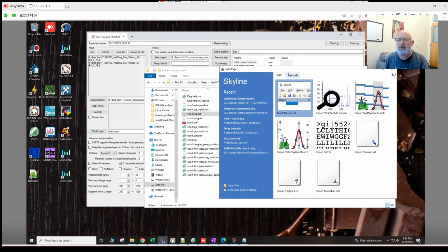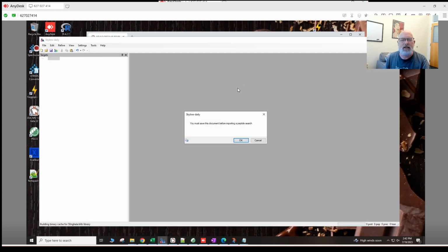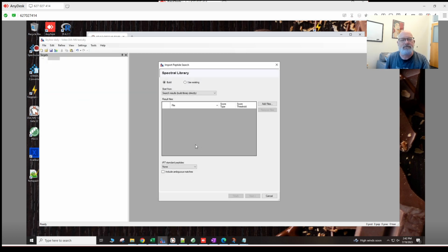We're going to go to Import DIA peptide search, and it takes me a couple of times to get this right, but hopefully I'll get it right in this video. You must save this document to continue, so I'm going to save it in my documents directory and call it video DIA-NN test or something.